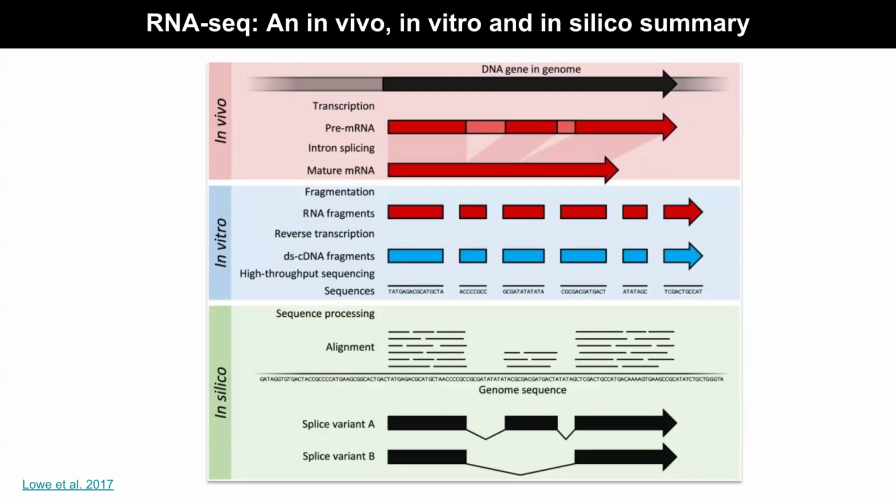Okay, so this is gene 1, isoform 1, gene 1, isoform 2, and gene 1, isoform 3. Gene 2, only one isoform, and gene 3 has isoforms I1, I2. So you saw that gene 1 has 5 counts. Now, among those 5 counts, this distribution could look like this: isoform 1 can have 2 counts, isoform 2 also has 2 counts, and isoform 3 has the rest. This is all theoretical, it can be any permutation. Similarly, gene 2 has only one isoform, and gene 3 has I1 and I2, so 5 and 10.